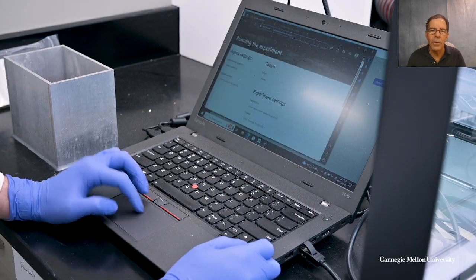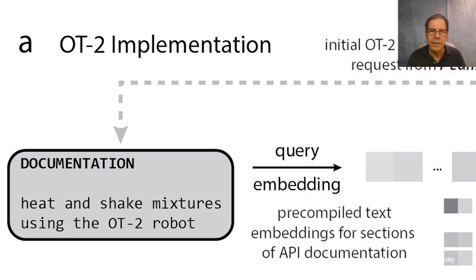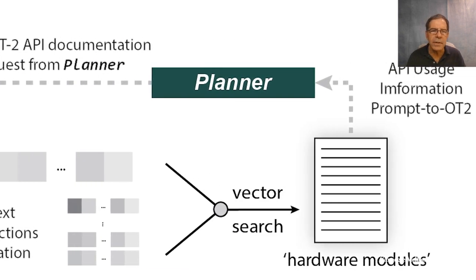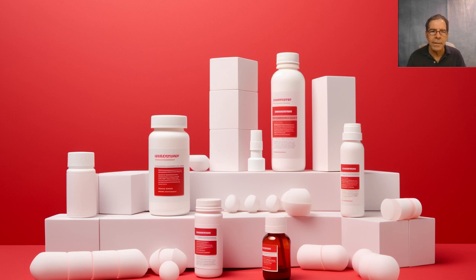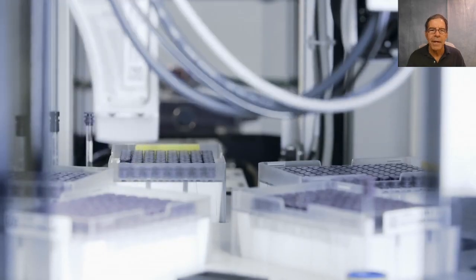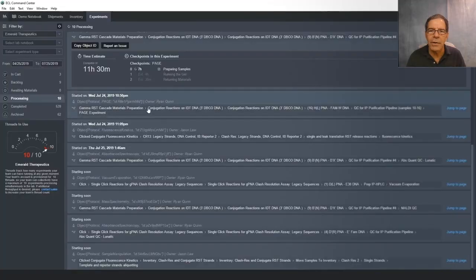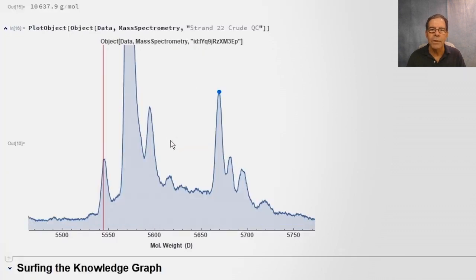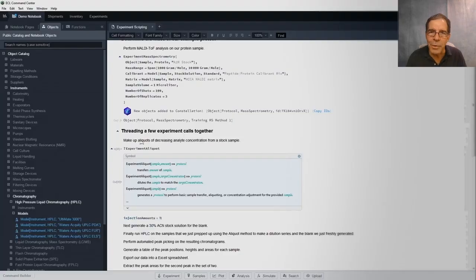It's interesting how Coscientist was trained. Part of the training process asked the model to figure out how to create things like aspirin, acetaminophen, and ibuprofen. It was able to do that. In another part of the training, it was taught how to direct the activity of robotic lab equipment. Here's what it was told to direct lab equipment to do.